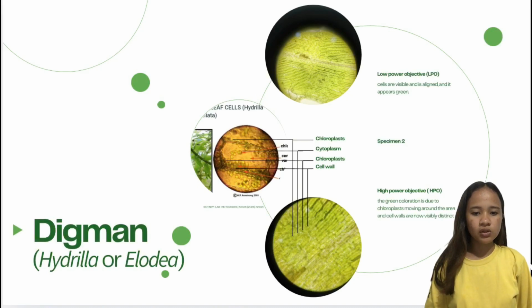The green, dust-like chloroplasts could be seen slowly circulating around the inside of the cell. This movement is called cytoplasmic streaming, a process that helps the cell distribute nutrients. Hydrilla is a perfect specimen for studying live plant cells because the chloroplasts are active. The movement we observed is proof that the cells are alive. This specimen is very helpful in visualizing chloroplasts and cytoplasmic flow.